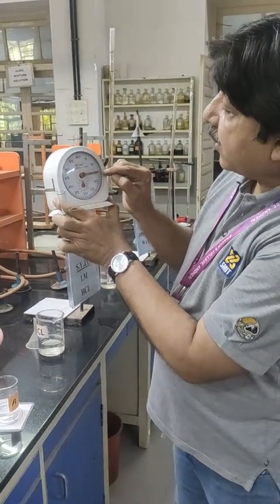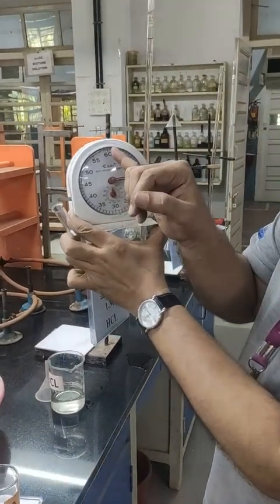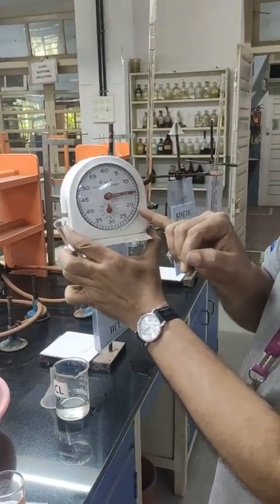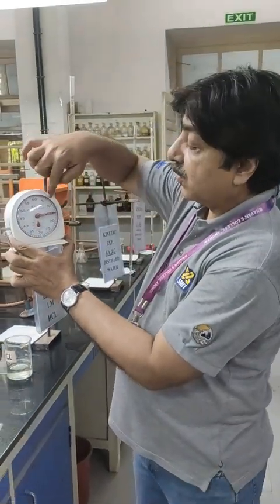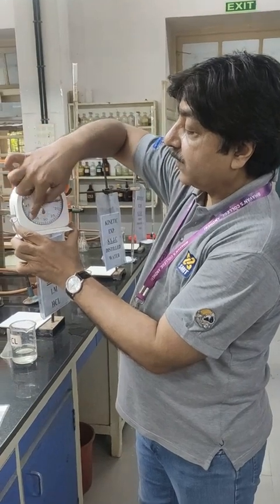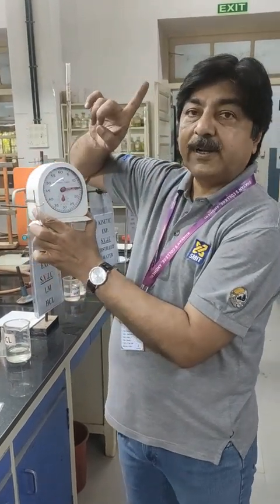Now how much time has it recorded? It starts from here: 0, 5 seconds, 10, 15, 20, 25, 30, 35, 40, 45, 50, 55 and 60. So when this rotates and takes one round, it amounts to 1 minute, that is 60 seconds.